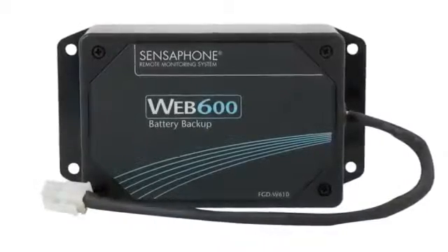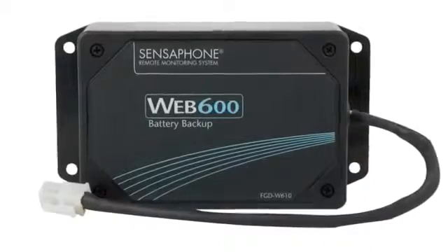With the addition of the optional battery backup module, the Web600 can monitor for power failures and stay operational for two full hours while power is out.